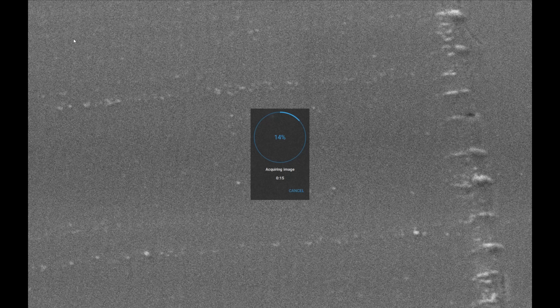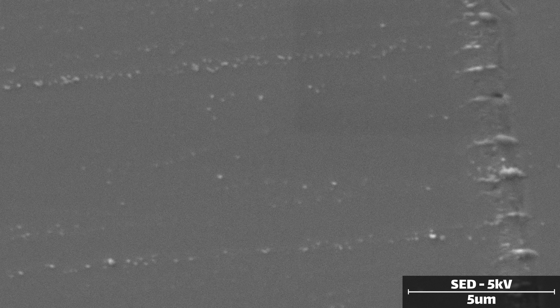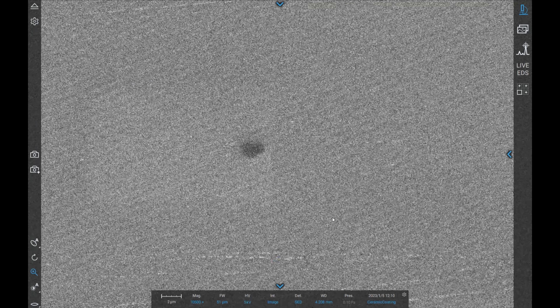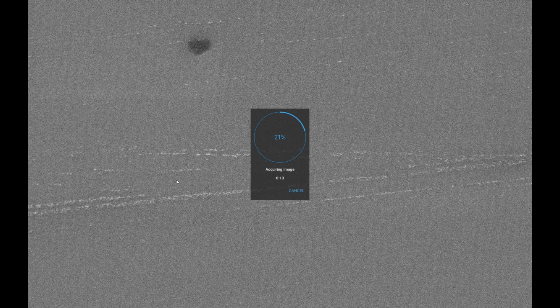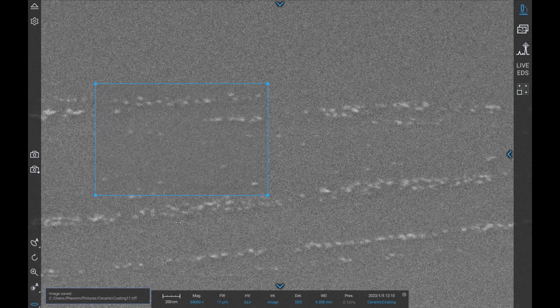The other conclusion is that the particles we're seeing are in fact the silica, and there's just not a lot of it in the spray — presumably because it doesn't actually do anything. It's amorphous silica, silicon dioxide glass basically, and putting glass on top of your windshield glass or paint probably just doesn't do much of anything at all. So why put that much of it into a spray when it's mostly a marketing gimmick? I don't know if this is true — I looked and couldn't find a patent for this particular spray. I don't quite have the right equipment to chemically analyze it either. But from a purely morphological point of view, just looking at it, it doesn't look like there's a lot happening with this silica particle business. That's not to say this stuff doesn't work — it seems to be moderately water repellent. But I suspect the amorphous silica bit is just a marketing gimmick, which honestly is a little disappointing. I was hoping this would be some type of interesting ceramic nanoparticle spray that we could abuse for other purposes, but it doesn't look like that's the case.